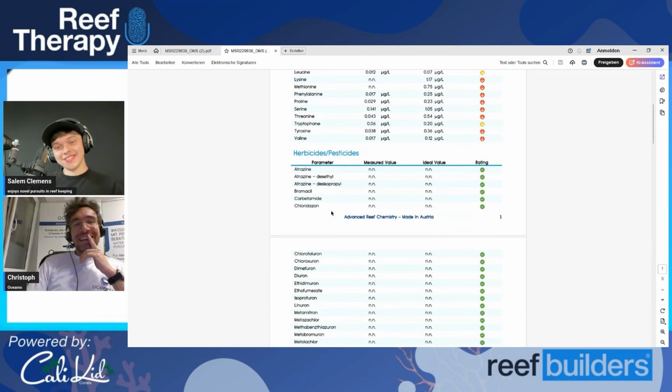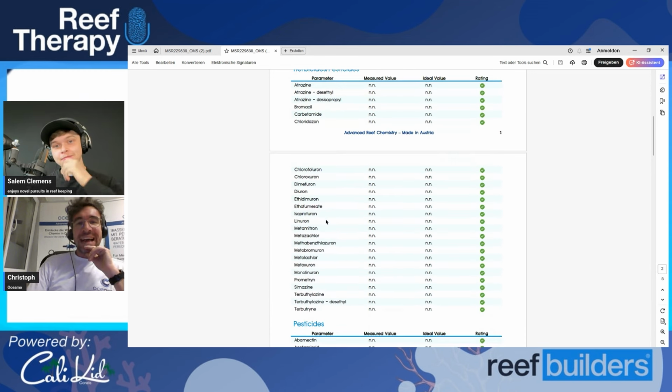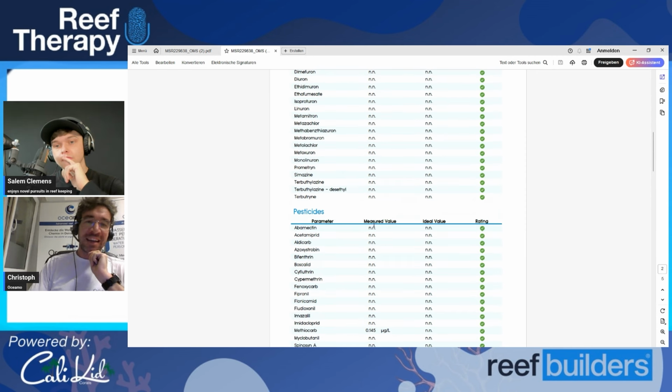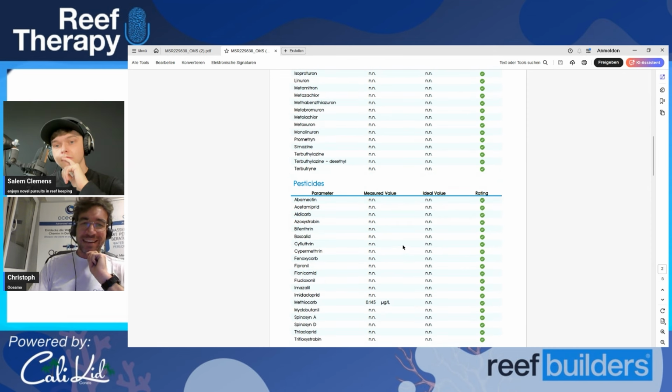For sure. Now let's move into the area of herbicides. Many of those are quite common chemicals in agriculture and also in gardening to get rid of some weeds or to get rid of plants in general. And many of them, like diuron or monolinuron, are really known to be dangerous for coral. So the ideal value, of course, is that we can't detect them, because the moment we detect them, it's likely already too much. So having all this NN, which is German, nicht nachweisbar, non-detectable in English, is actually a good thing, having those things non-detected.